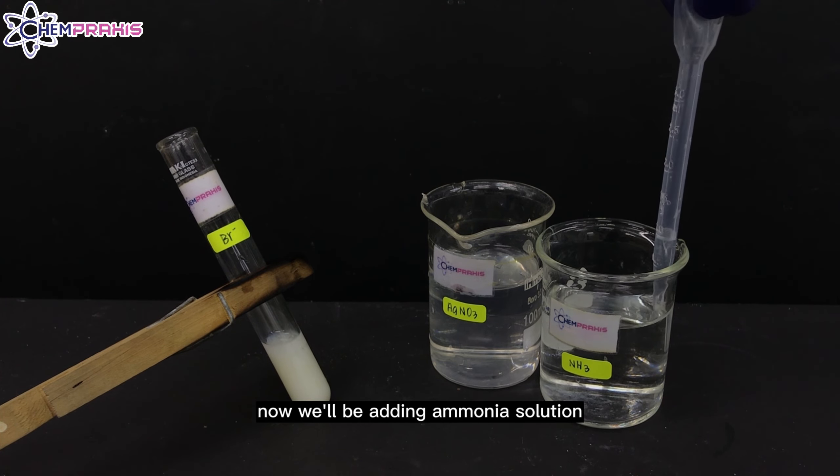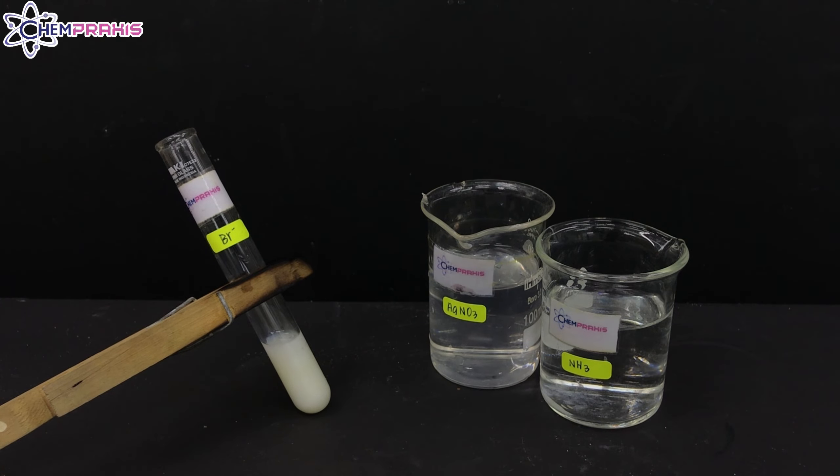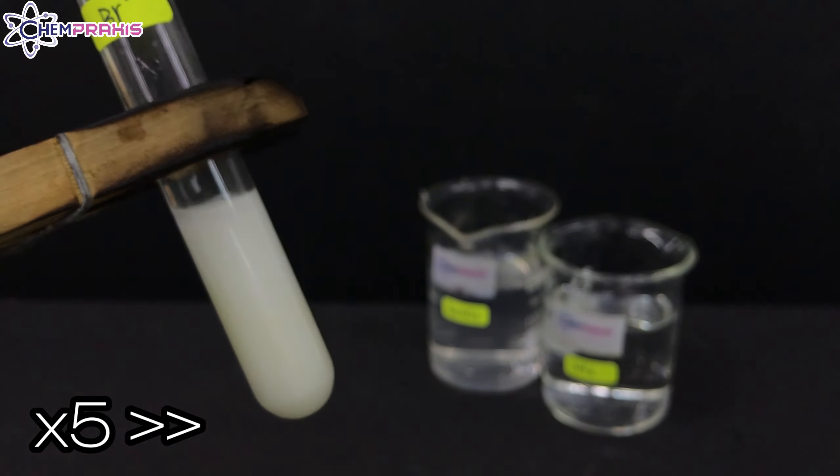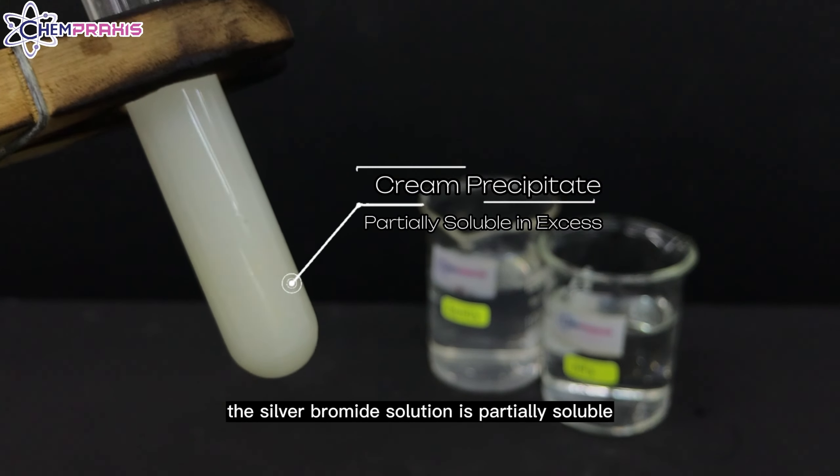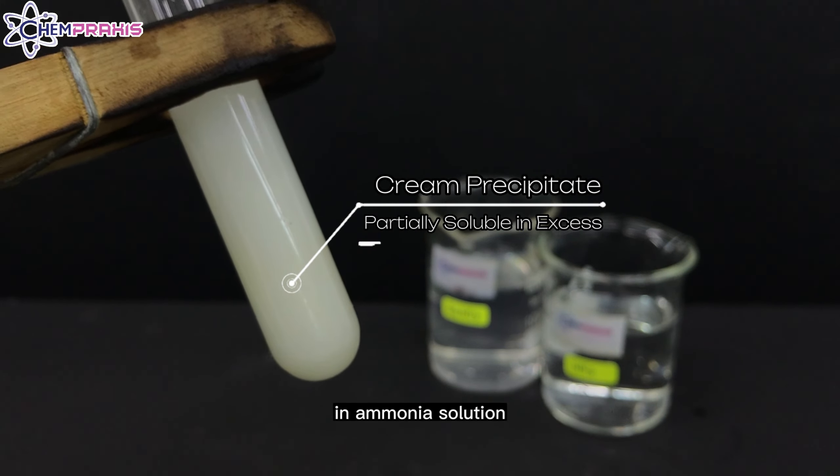Now, we will be adding ammonia solution to the bromide ion solution. The silver bromide is partially soluble in ammonia solution.